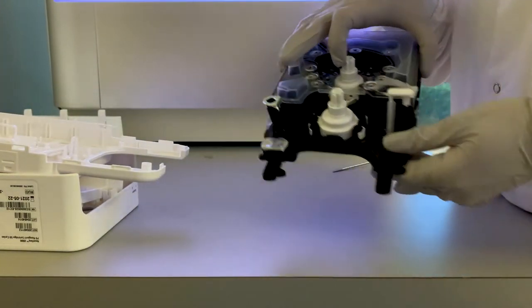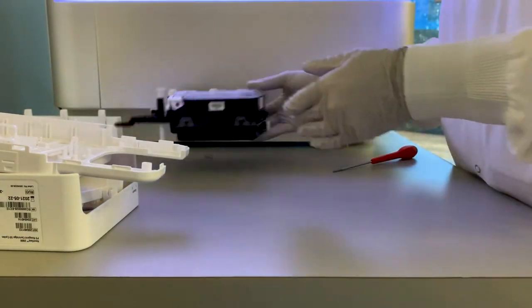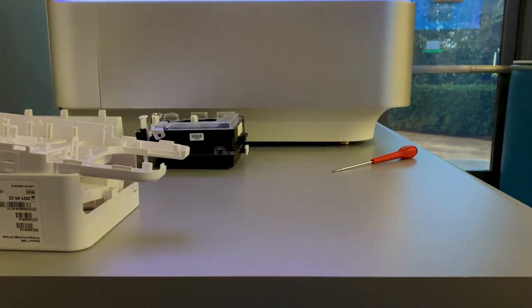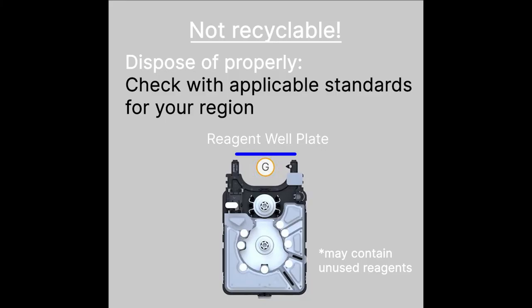The reagent plate is not recyclable. Dispose of the reagent well plate, which may contain unused reagents, in accordance with the applicable standards for your region.